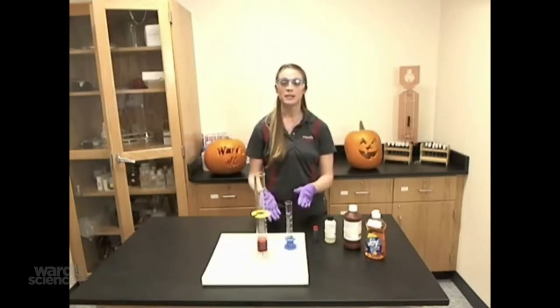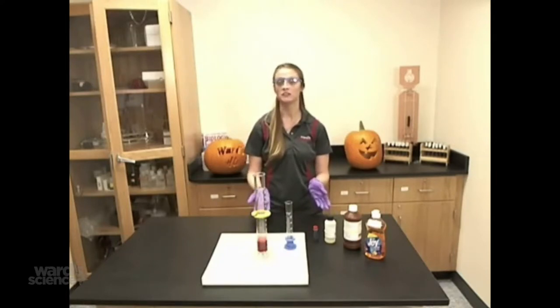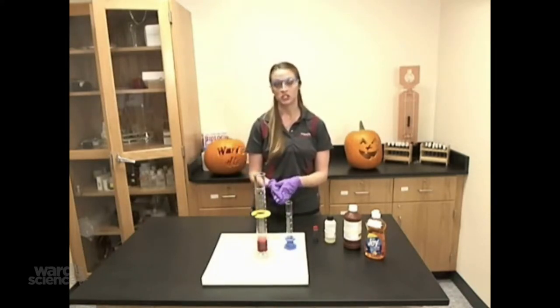To begin, mix 5 to 10 mils of the dishwashing detergent and 35 mils of the hydrogen peroxide. You can also add some food coloring to make it more colorful and fun, and mix this solution with a glass stirring rod, then add it to a large graduated cylinder or the Wards demonstration tube.